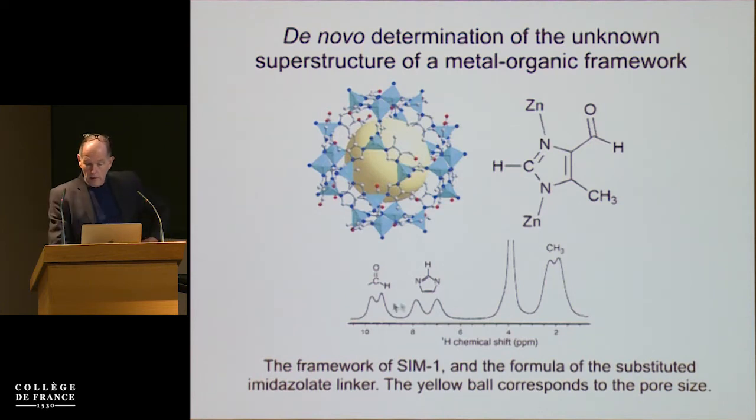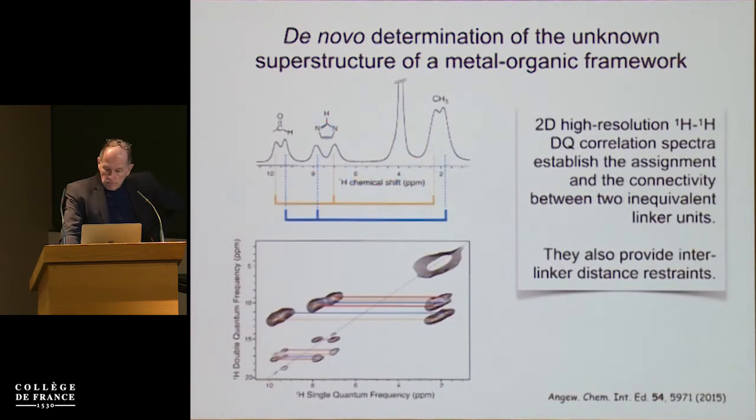And this is completely unambiguous. These lines are very well resolved for this kind of spectroscopy. And so it's also telling us that it's a highly ordered structure. It is not a disordered structure. So we don't just have a random set of linker orientations.